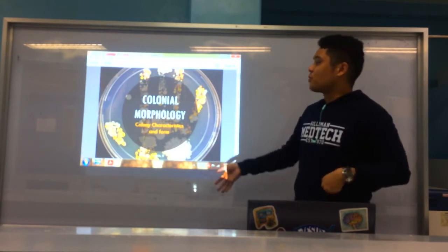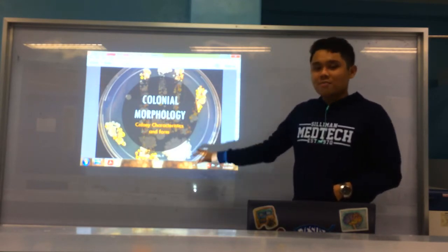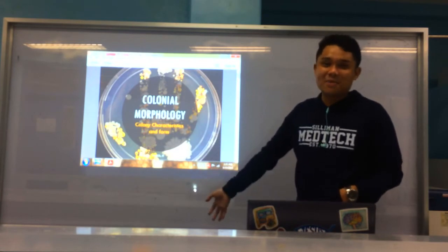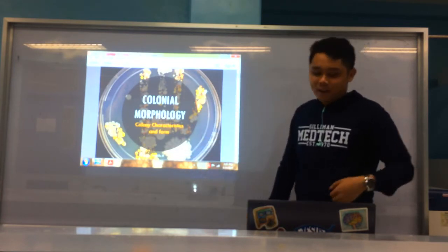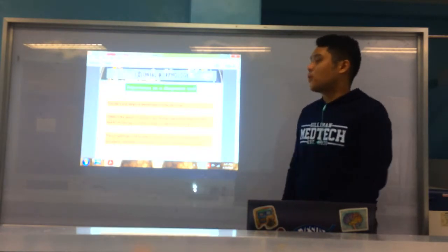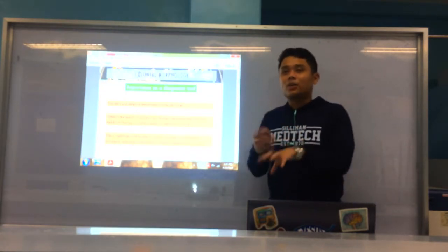So again, this is colonial morphology. This is from Sir Jemu. I don't have the PowerPoint copy, so I wasn't able to give it to you, but there is a PDF, so we'll just use the PDF. We'll start first with colonial morphology. Why is it important, or what is its importance?